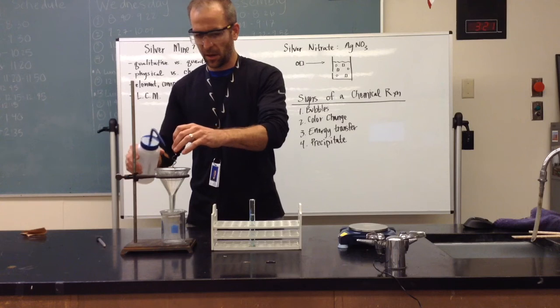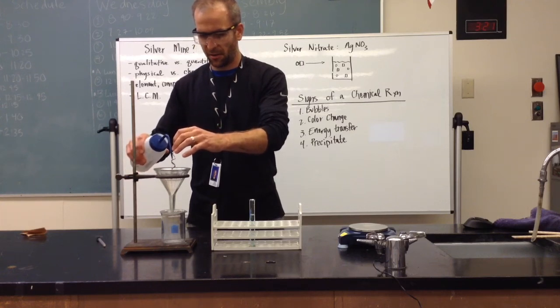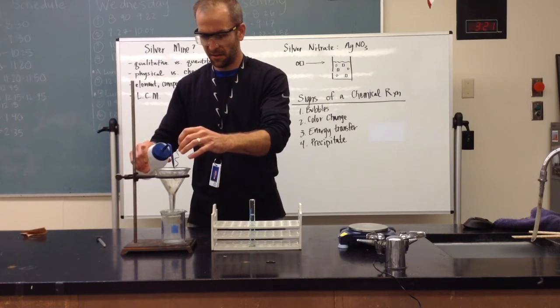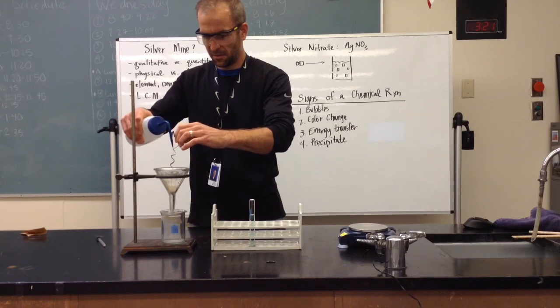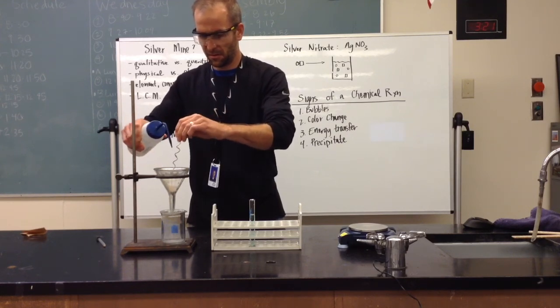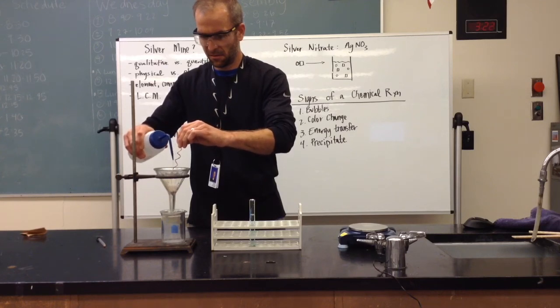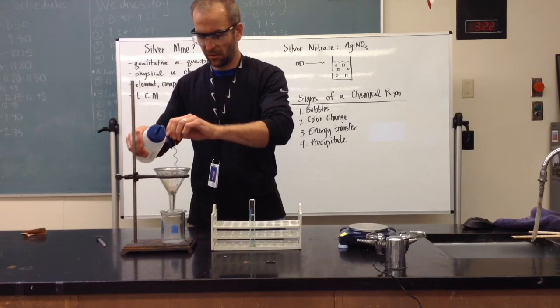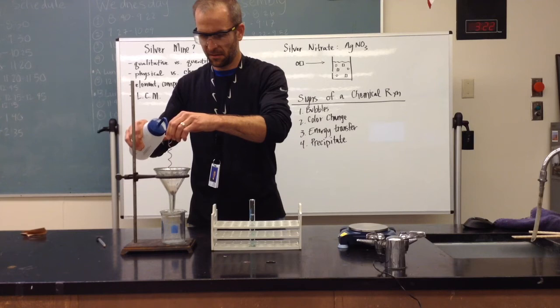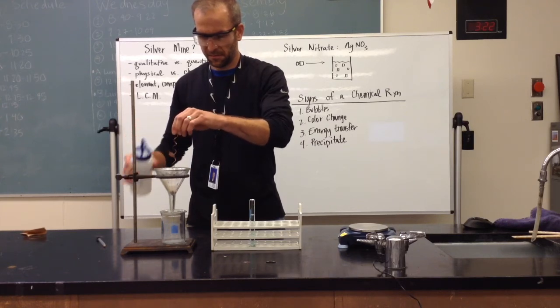I'm going to rinse my wire off into my filter paper. Save a little work here. Going directly into the filter paper. Okay.